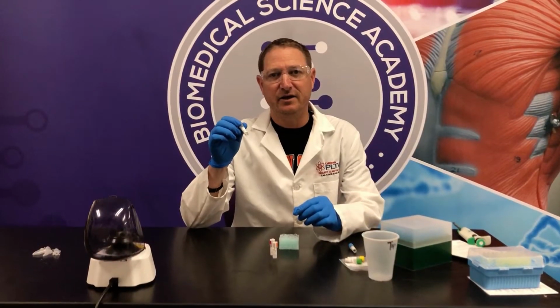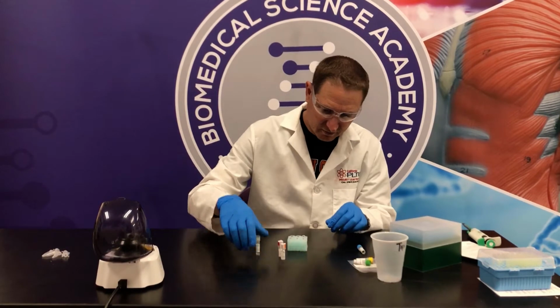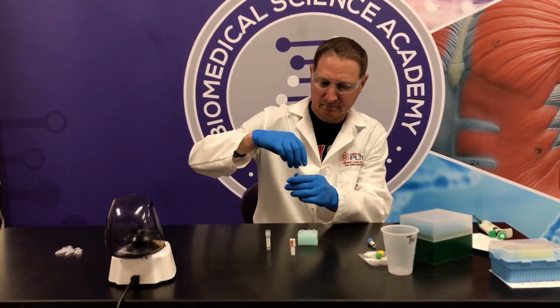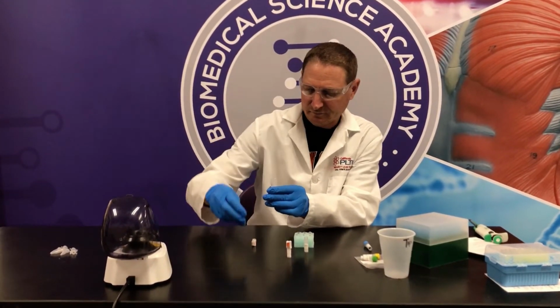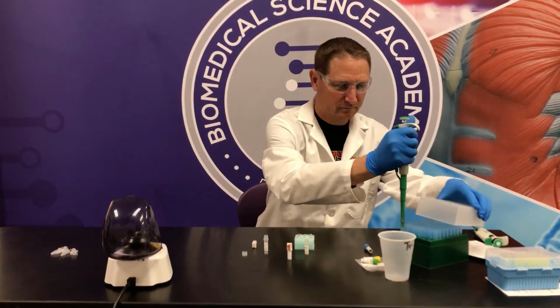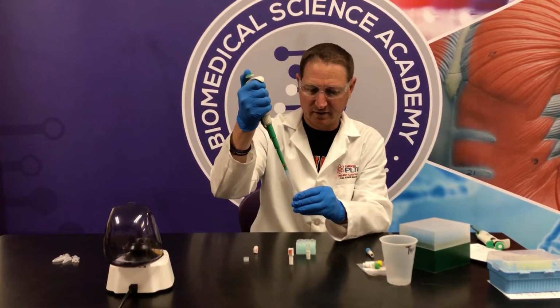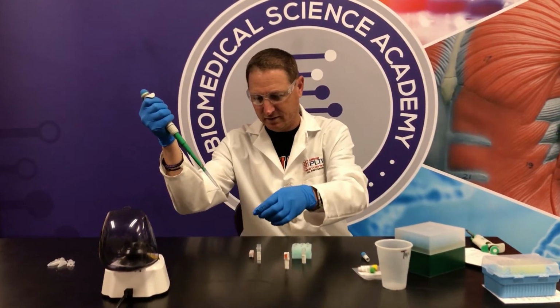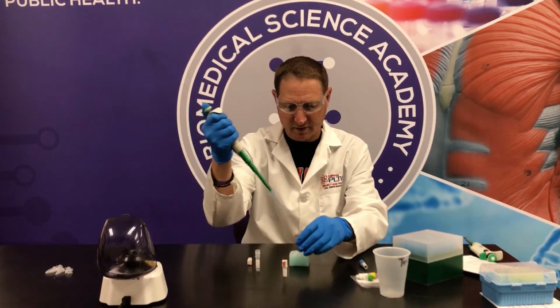All right, now that I have it spun down, I'm going to add 150 microliters to my HIN3 and my EcoRV. So I'm going to go ahead and open, start with the Eco, break the seal on it. And here's my dilution buffer. And again, 150 micros into there. The dilution buffer, I'm already set at 150. Top back on here. I'm going to add it.